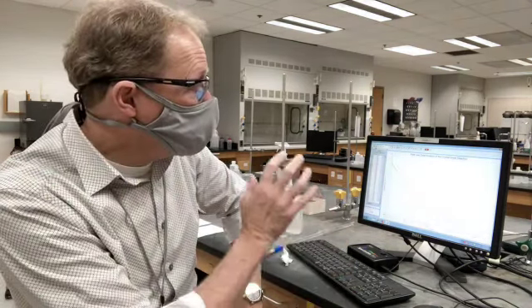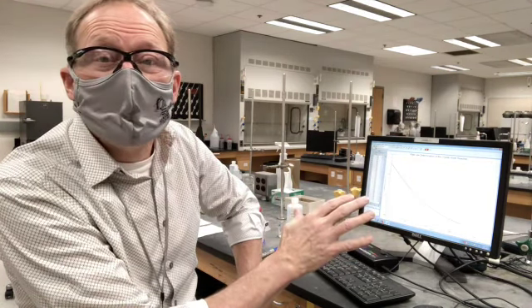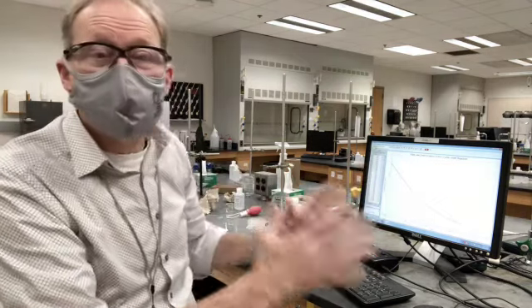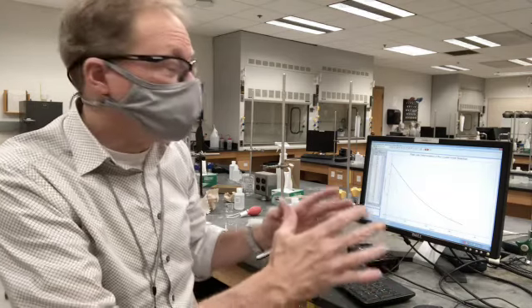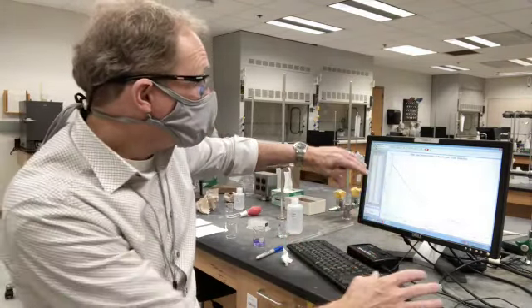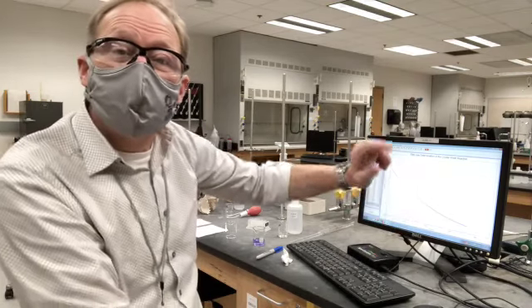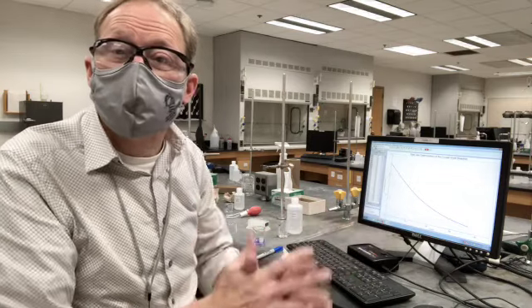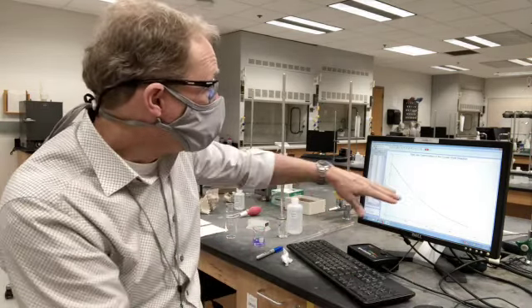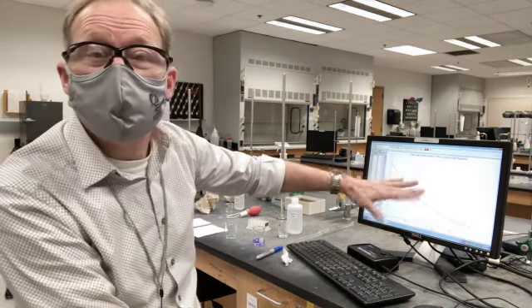This file I'm going to save so that you can open it up. You'll need LoggerPro on your laptop in order to analyze this data. If that presents a problem, then I would like you to email your lab instructor and we will make some accommodations. The most straightforward way is to model what's happening in the lab — this will be a file which will have this data and you're going to fit these data. This decay is clearly showing a curved decay, and whether that curve best matches a first order model or a second order model is what you'll discover by doing this fitting process. So ideally you'll get LoggerPro and you can follow the fitting procedure and figure out which model works best.